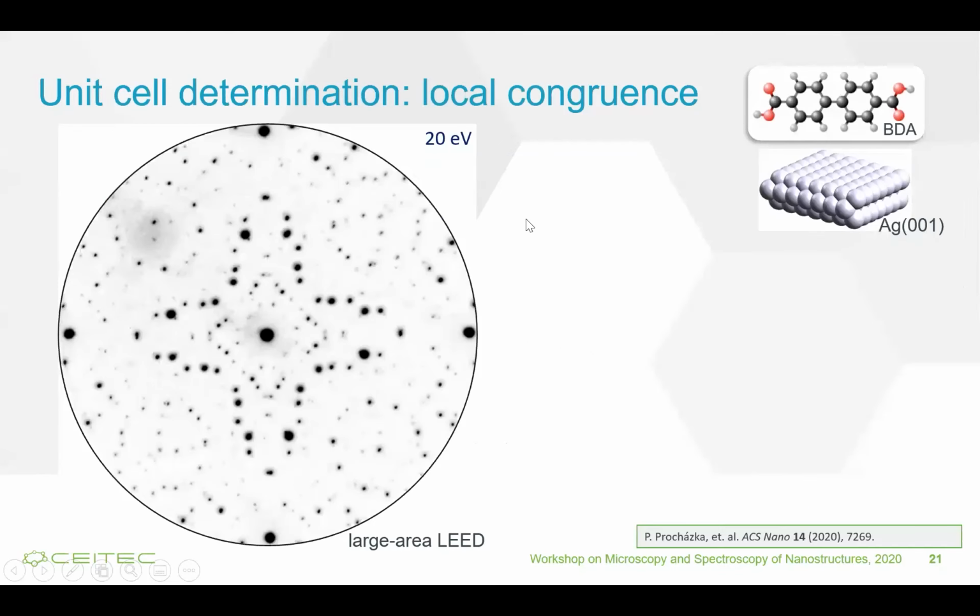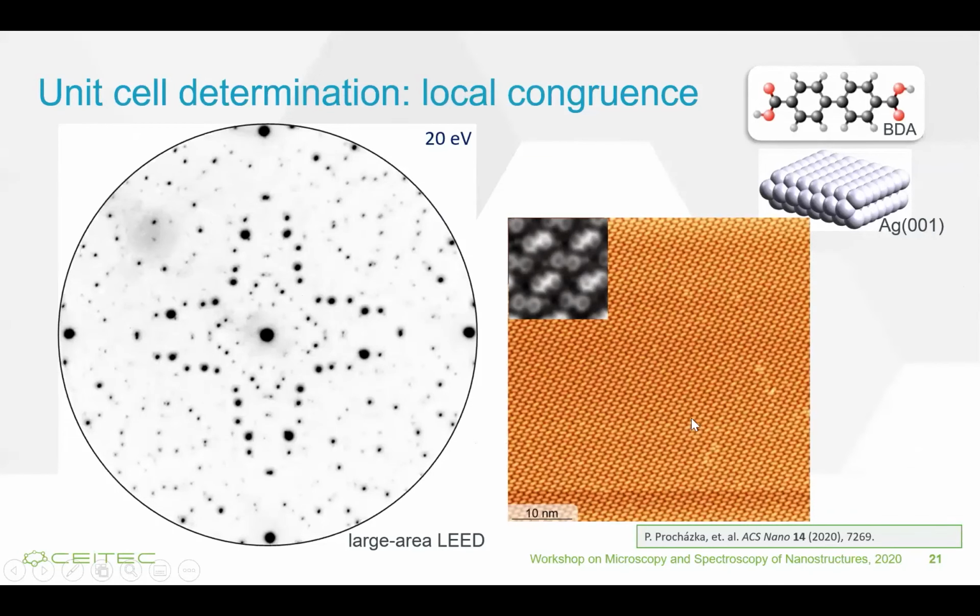So this is the diffraction pattern at 20 eV. We have the advantage to take the STM image from the same structure. So here we see how it looks in real space, which is quite necessary to correctly assess the diffraction pattern. We can even, in collaboration, do this nice atomic force imaging introduced by Franz Giessibl.